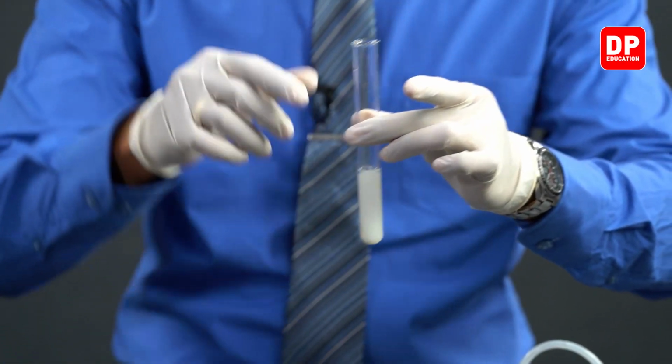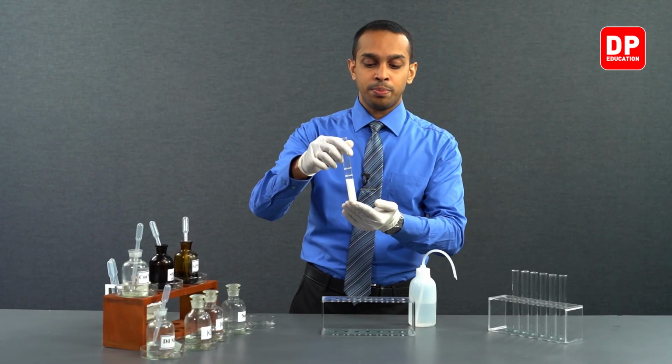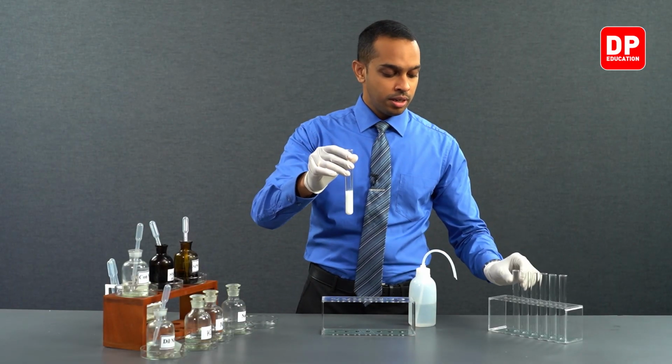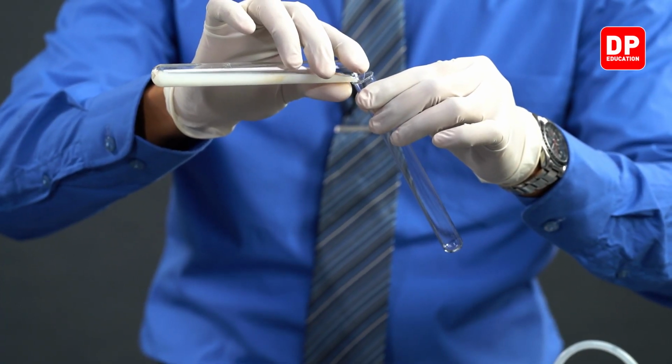Now, as we did before, we will dilute this precipitate a little bit. Now it's suspended in water, right? So we'll take this solid suspension and transfer some of it into two other test tubes.